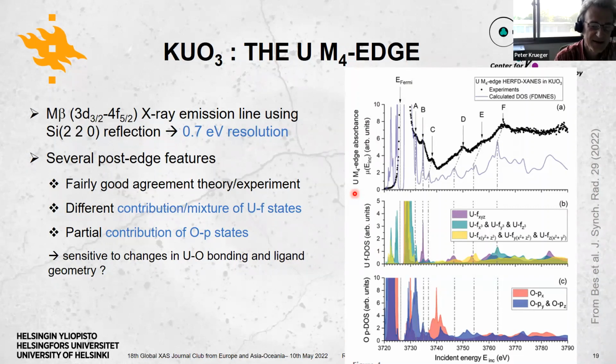I don't know. And then I have another question, again, to what Professor Asakura already asked about this p-DOS. It's also not clear to me. If you look at the symmetry of your potassium uranium oxide, this is totally cubic, isn't it? So then shouldn't all three DOS, px, py, pz, be the same? And even if you project on one oxygen that is maybe on an axis between two uranium atoms, you should still have at least two others, say y and z, to be the same. So for me, this is not clear why this comes out so differently. Well, maybe it's a detail.